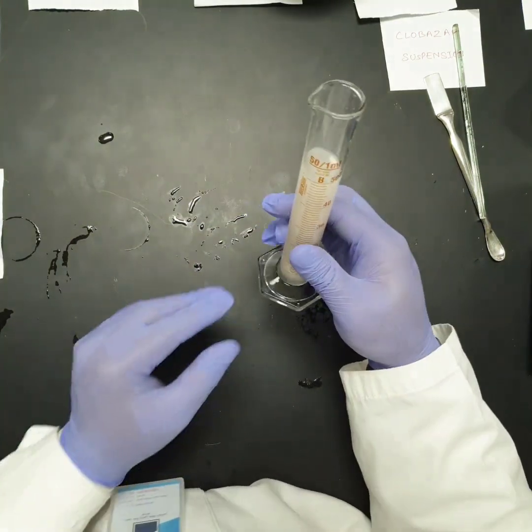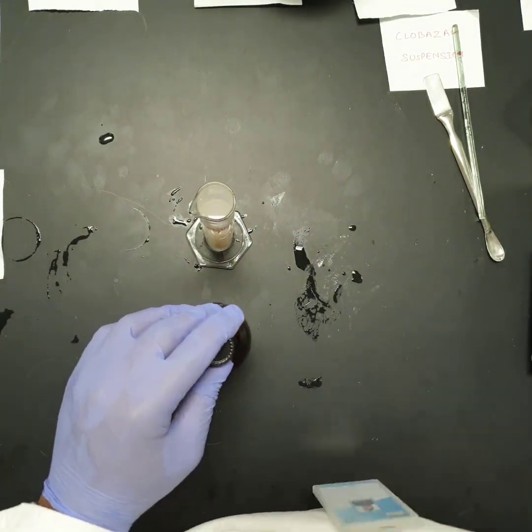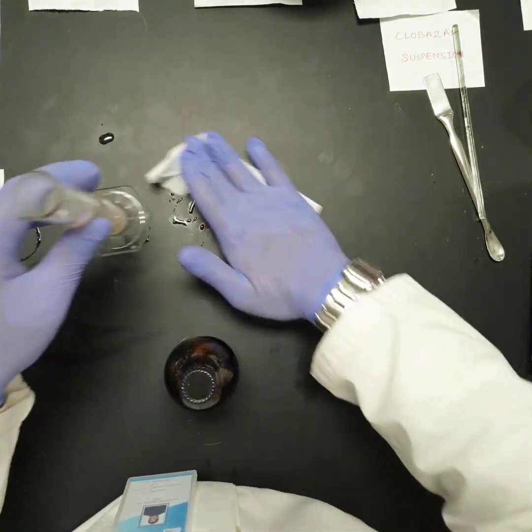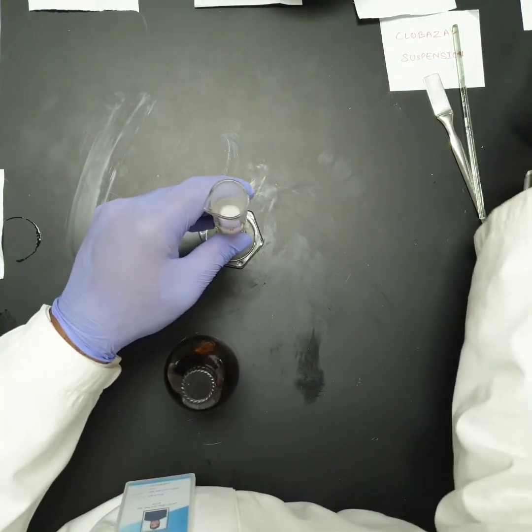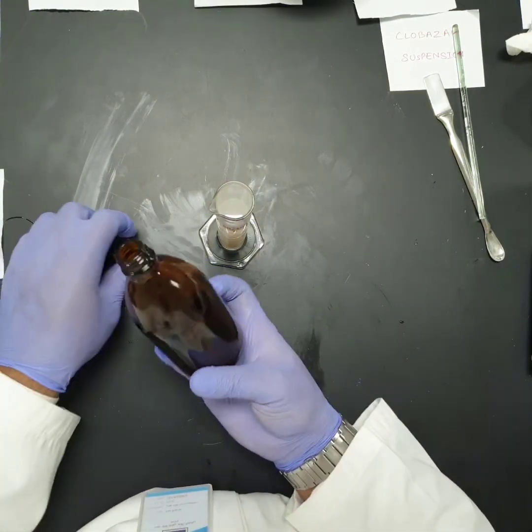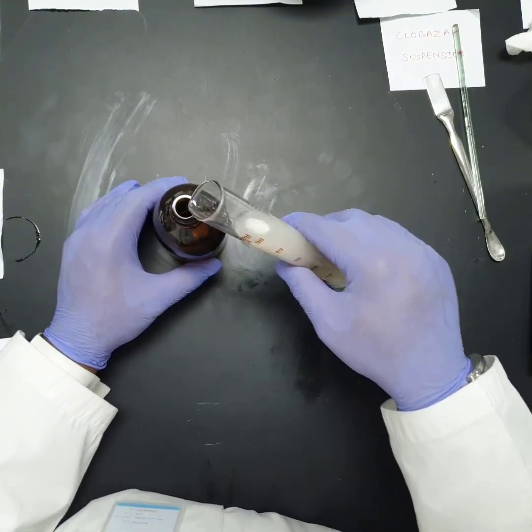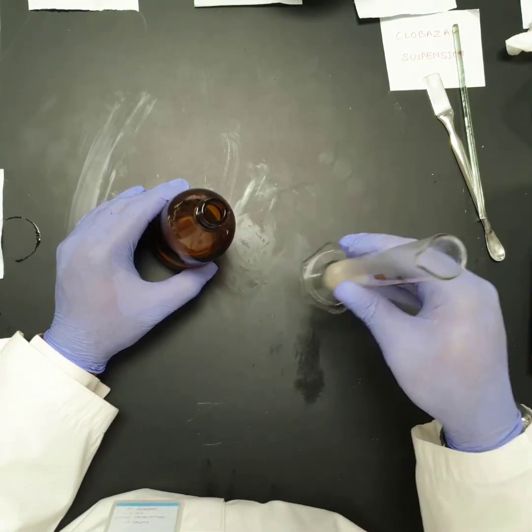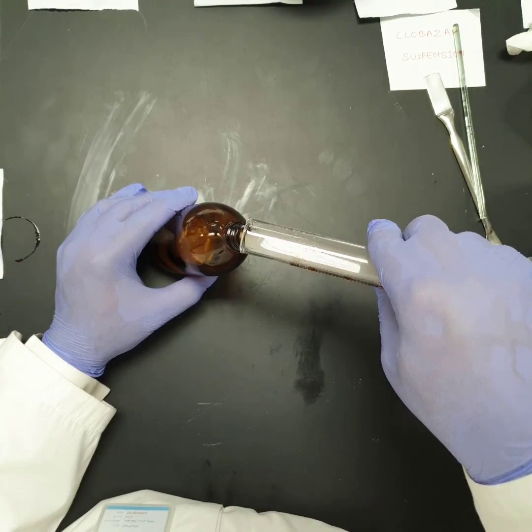So now this is the final product. I am going to take an amber glass bottle. I am wiping off the sticky syrup and glycerol from the preparation table. So this is the amber glass bottle. I'm going to add the final product. I'm going to shake the graduated cylinder and then add it here. Before I add it all, I will shake more so that nothing is left here. All the suspension will be transferred.